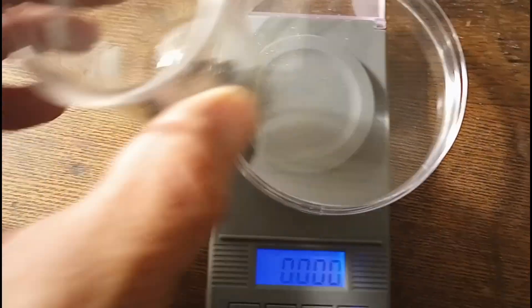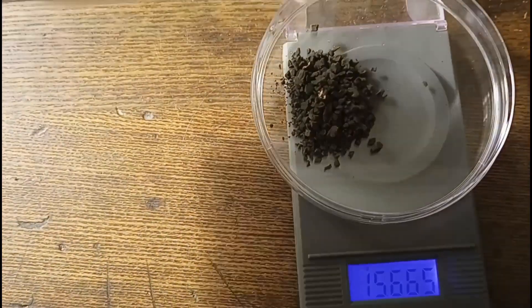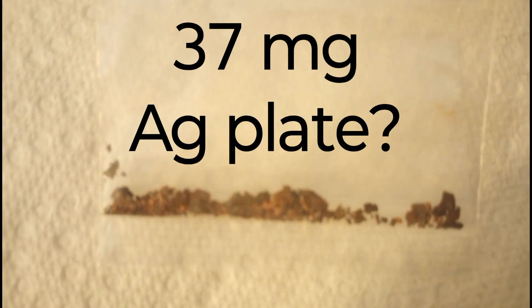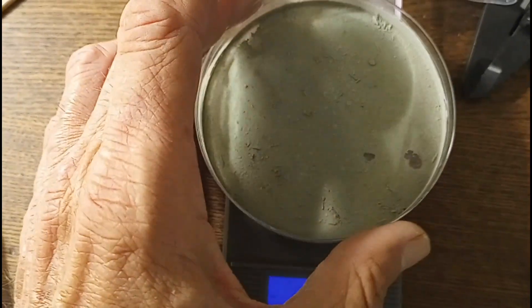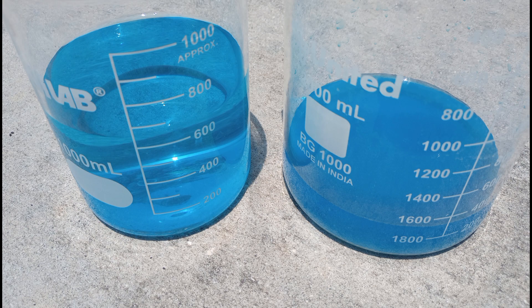This time our undissolved material does not look copper plated, and it's all dried out. That means we should have about another 6.5 grams dissolved in the solution. We also have our 37 milligrams of what might be silver plate, and this is the sediment from everything we've done so far — it's 0.326 grams, or about a third of a gram. It may still contain some water because it's only been air dried. These are the two solutions: the one on the left is more translucent from part one and part two, and the more opaque one on the right is from this video.